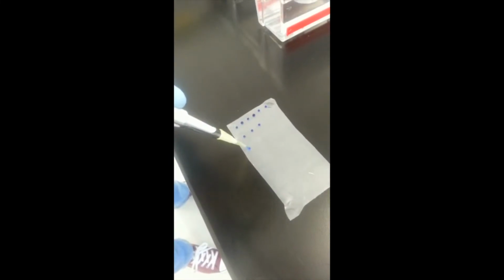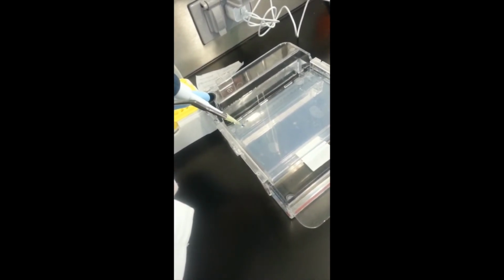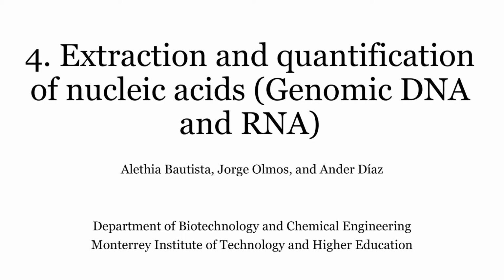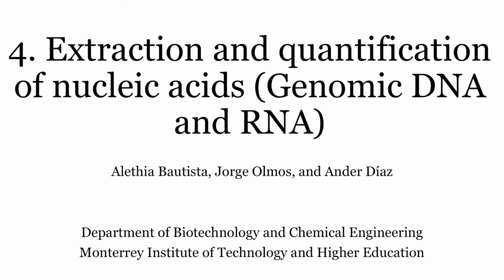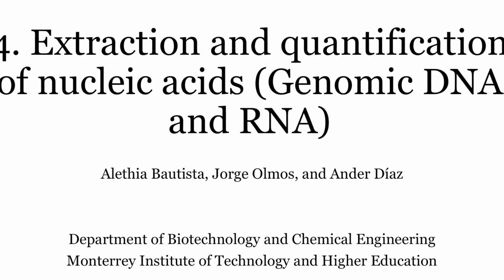As a conclusion, when obtaining nucleic acid, it is important to look after the pellet forming at the bottom of the microtube. It is better to leave supernatant in the microtube than lose sample. You have to be careful when mixing by inversion in order not to resuspend the pellet. It is also important that the chemical components used for purification are at the exact concentration and the exact pH, because the ionic forces can affect the sample and degrade it.